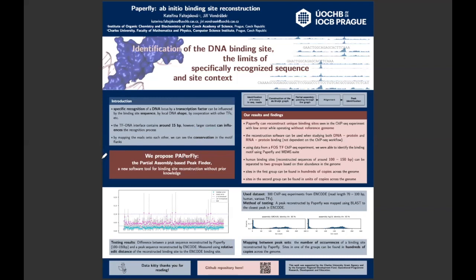By means of genome assembly algorithms, we have developed a tool for binding site reconstruction without any prior knowledge, including the reference genome. We take the sequencing reads from a ChIP-seq experiment or a similar experiment that produces reads with differential enrichments. We identify the k-mers in the sequencing reads.